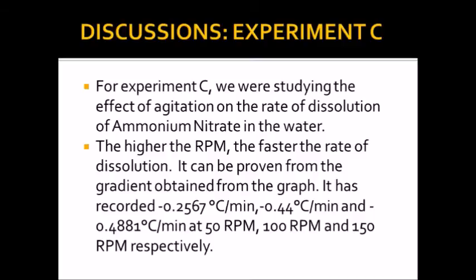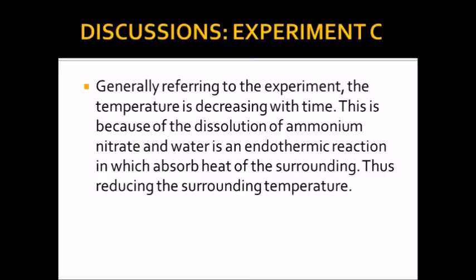This is because more rpm means more agitation that increases the rate of dissolution. Generally, we can see from the result of the experiment that the temperature is decreasing with time. The reason is dissolution of ammonium nitrate in water is an endothermic reaction. As we know, endothermic reaction absorbs heat that decreases the temperature of the solution.